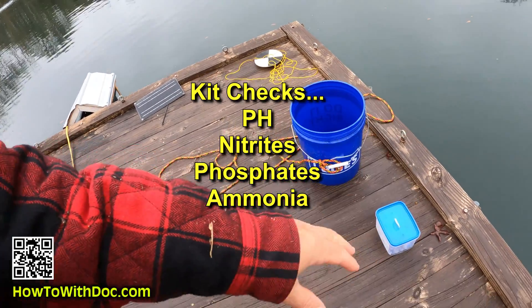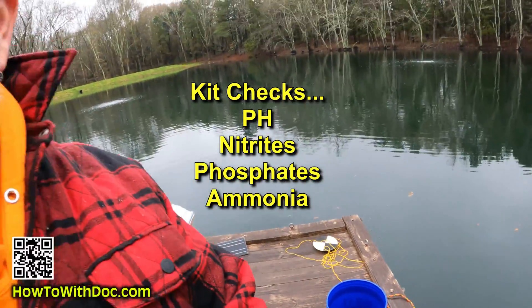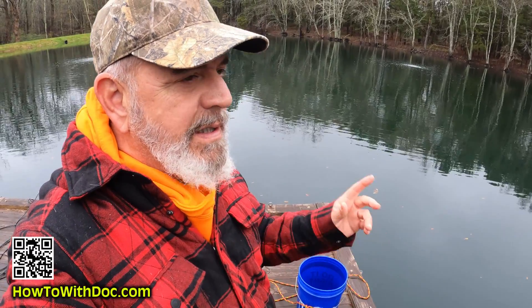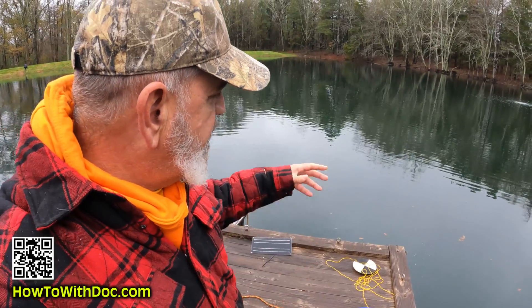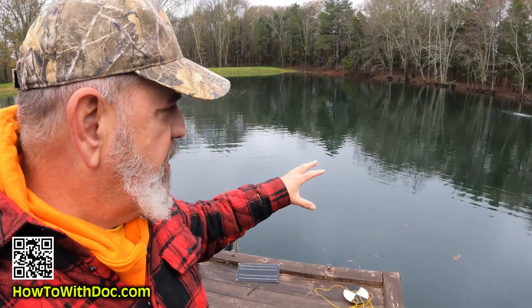All you need is this test kit — I'll link to it. It checks for a bunch of different stuff: pH, nitrates, phosphates, all that. Make sure you use a really clean bucket. I tie a rope onto it and throw it out to get a larger sample of the water. I don't want to just take it from the edge — I want a good sample from out here.